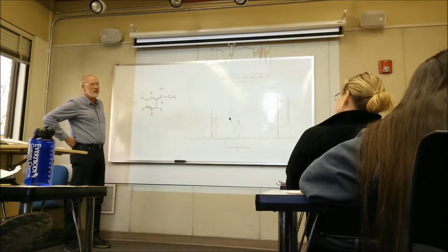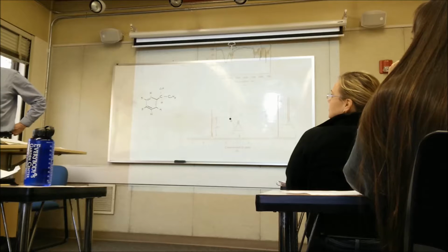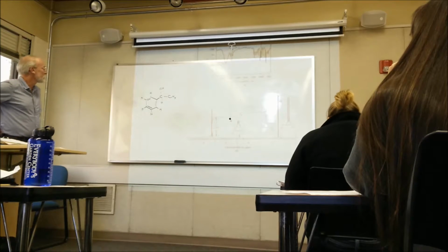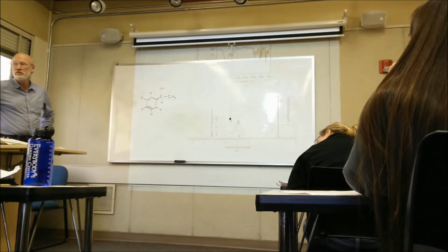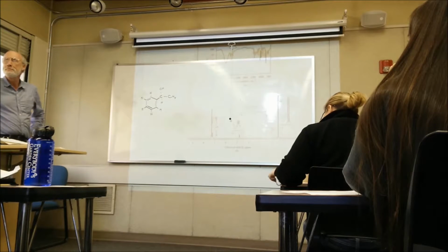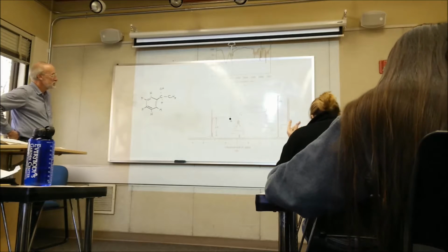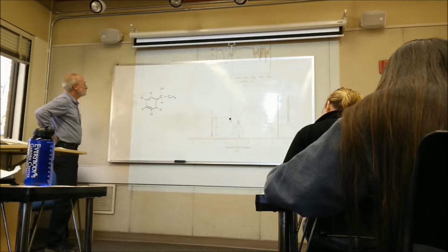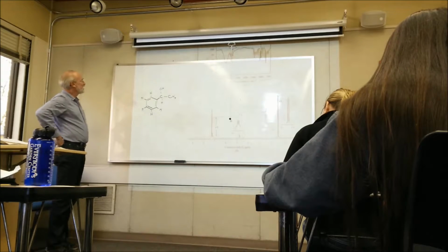Methylene or methine. Methylene groups are usually CH2 groups, so I guess it would be a methine. They show it as an alkane with methine, just a C with 3 R's and then a single H. And that's at a 1.4. So it's shifted. Okay, so there is some. I am going to guess.